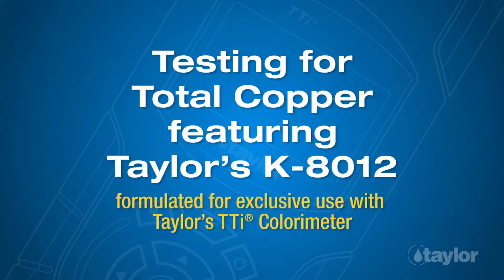Testing for Total Copper, featuring Taylor's K-8012, formulated for exclusive use with Taylor's TTI Colorimeter.